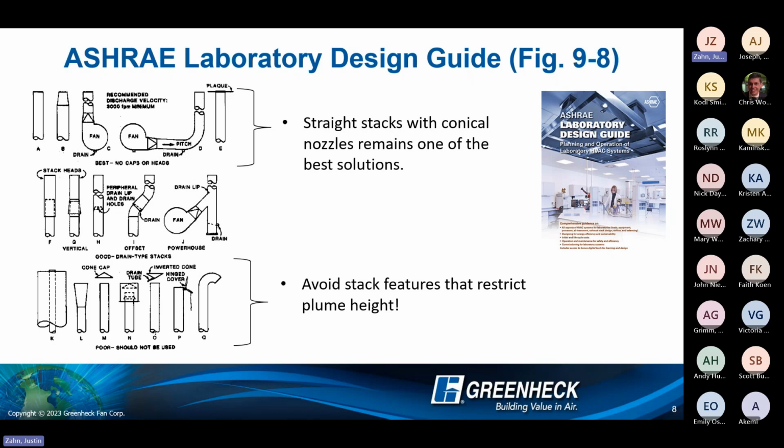And again, if that is a stack that you are wanting to use, then we would recommend moving away from the laboratory exhaust products. Okay, because there's no point of having a laboratory fan with a gooseneck type stack on it.